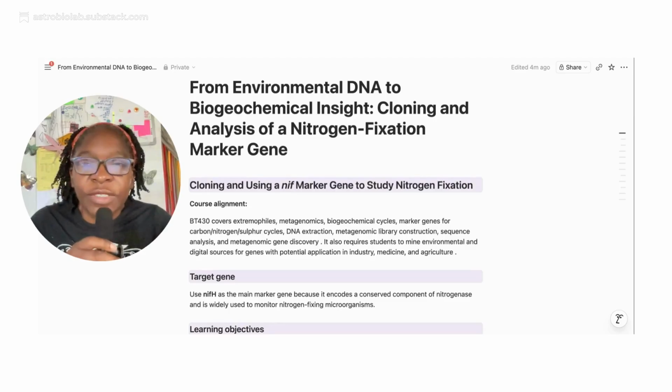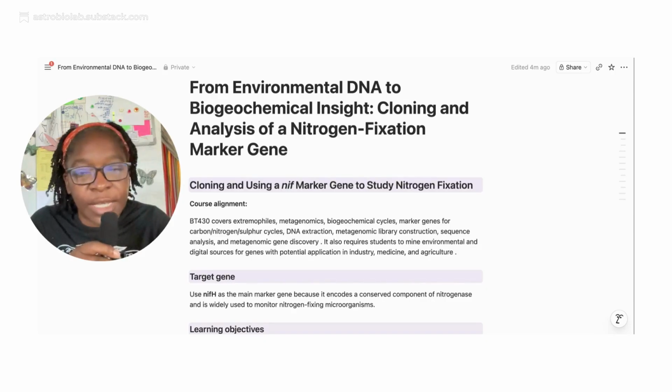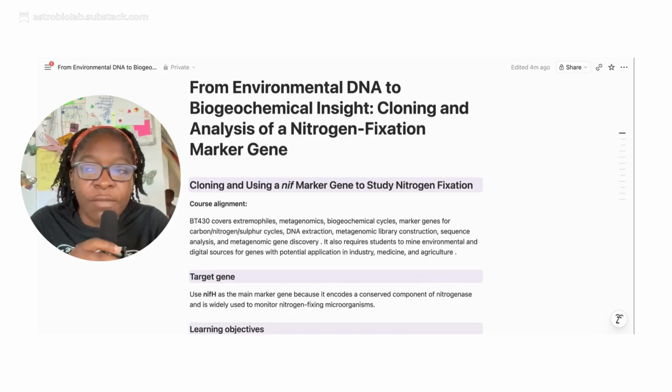Welcome to this video. So today we're talking about biogeochemical cycles and how we can use nifH genes and other genes like that in order to understand more about what these genes are doing in the environment. And in order to do this, you usually have to do some level of cloning or metagenomic analysis. So this video is just about cloning and how that would look and how you'd interpret the data.